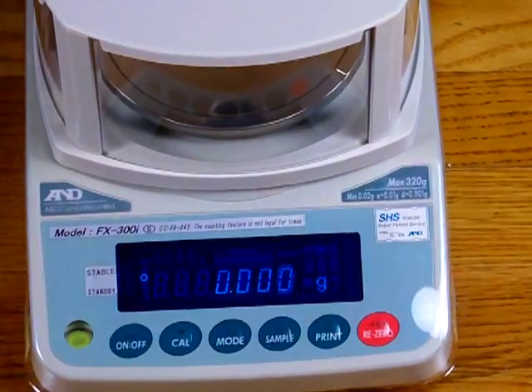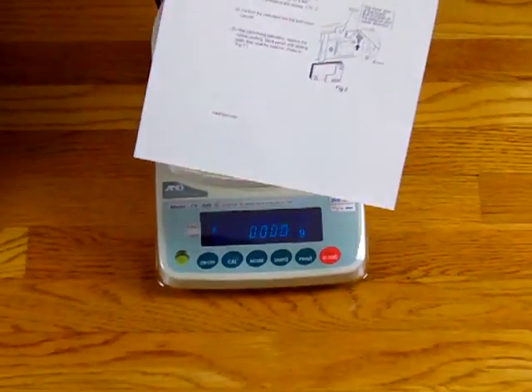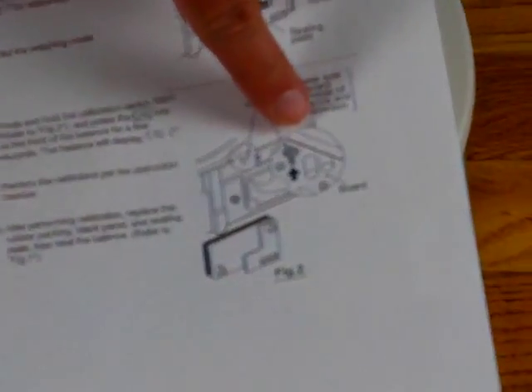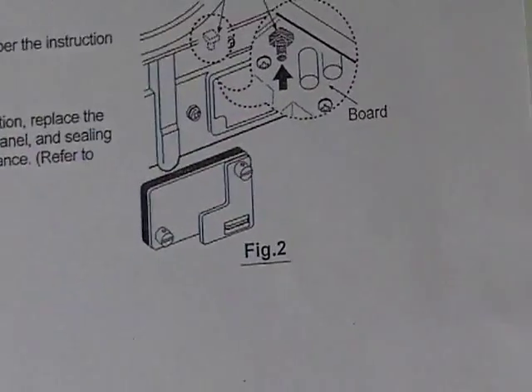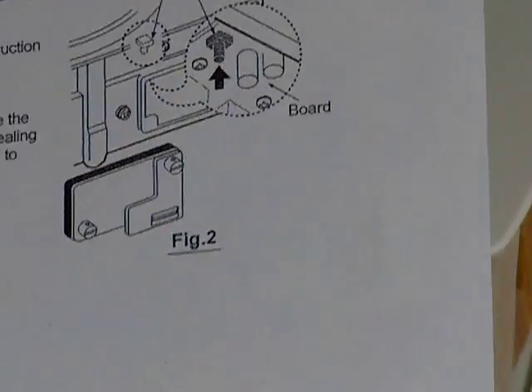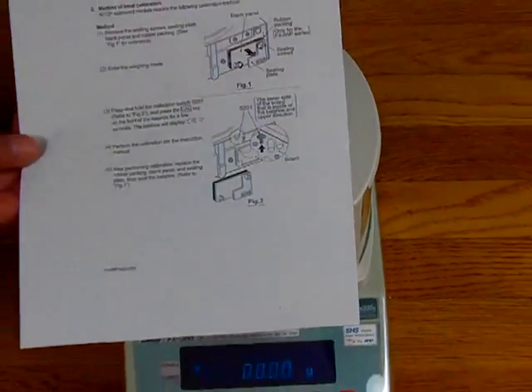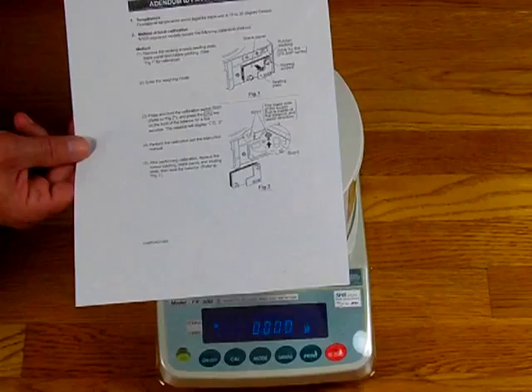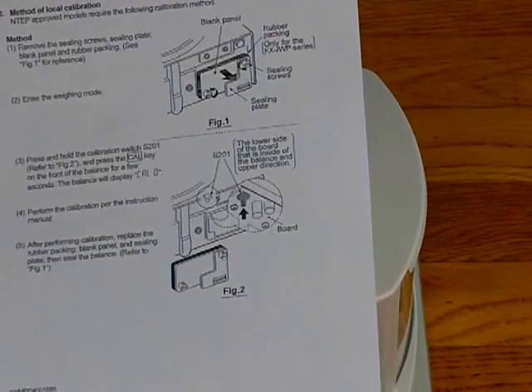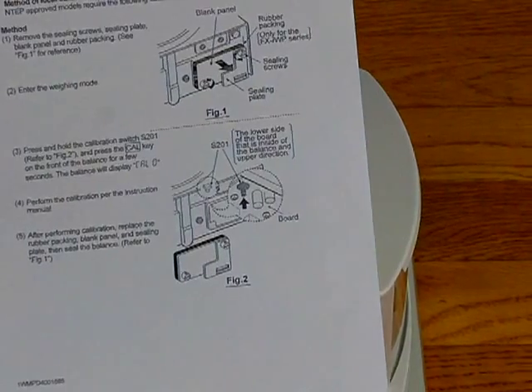When you receive this balance with the manual, there will be an addendum. This addendum shows that there is a button that must be pressed on the back of the balance in order to get into the CAL mode. You press this button on the back while depressing the CAL key to enter calibration mode. This button is required for legal for trade — weights and measures will put a wire through the back of this balance so there is no way to calibrate it once it has been placed into service.